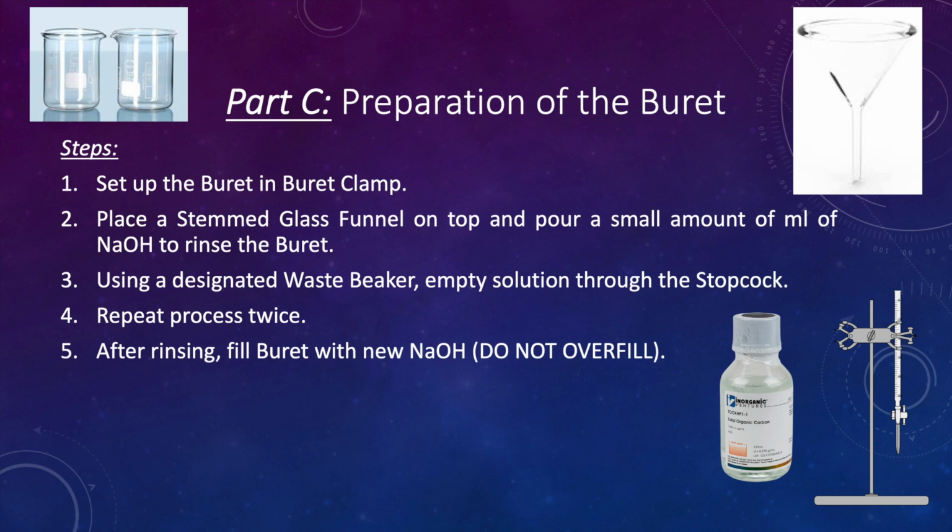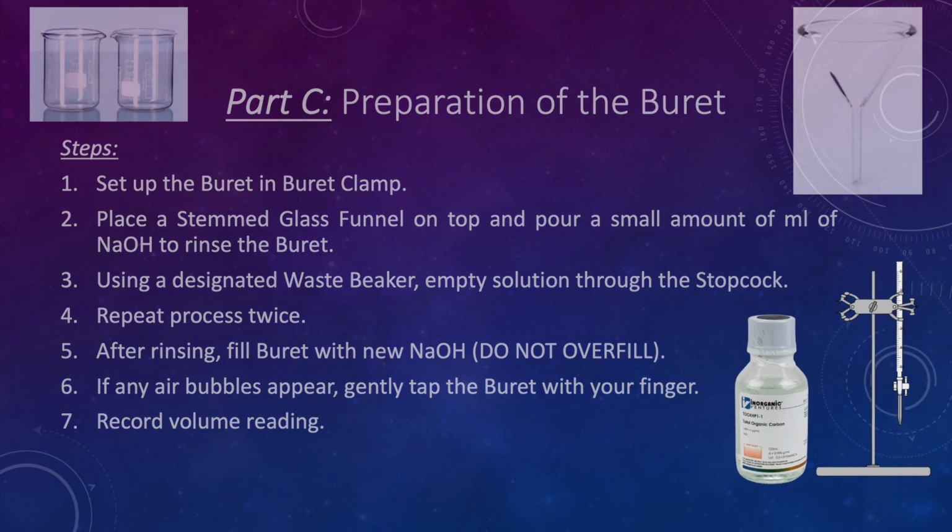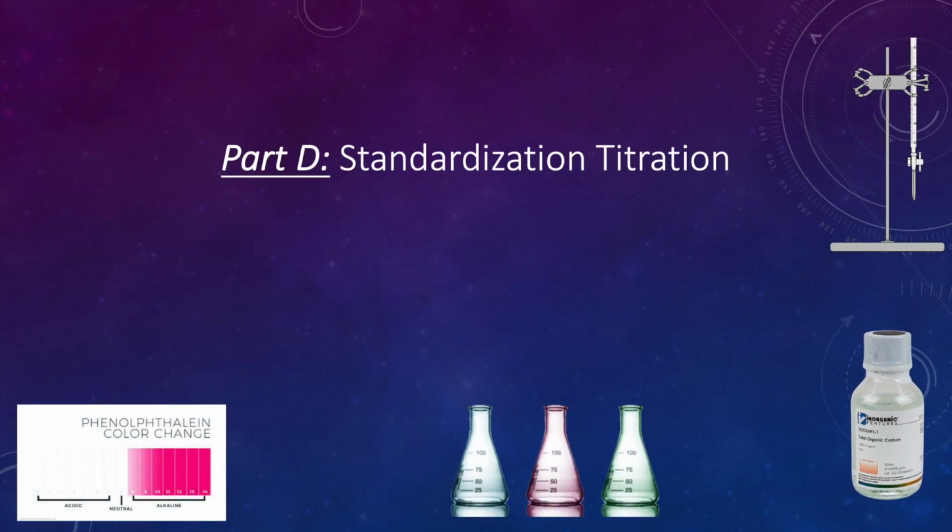After rinsing the burette, we're going to fill it with new sodium hydroxide, and just make sure you do not overfill it. If it just so happens that any bubbles appear, just gently tap the burette with your finger, and then we're going to record the volume reading.